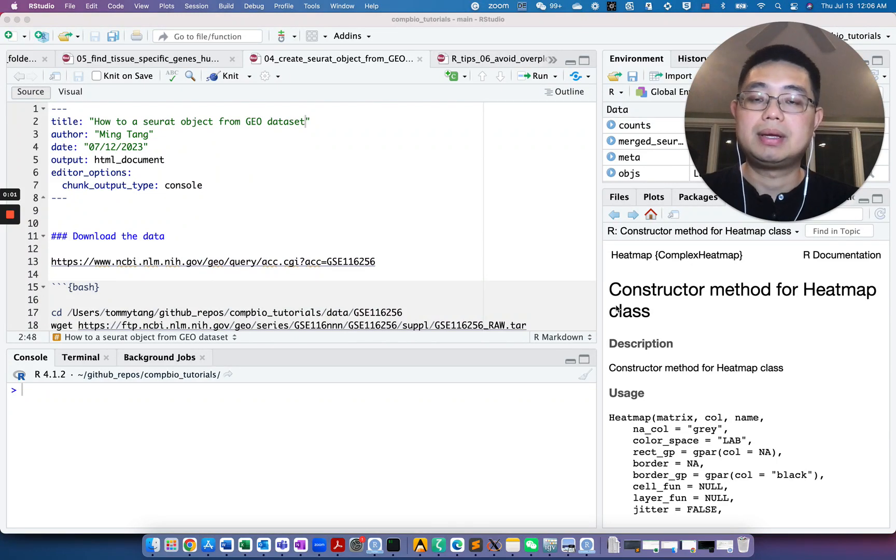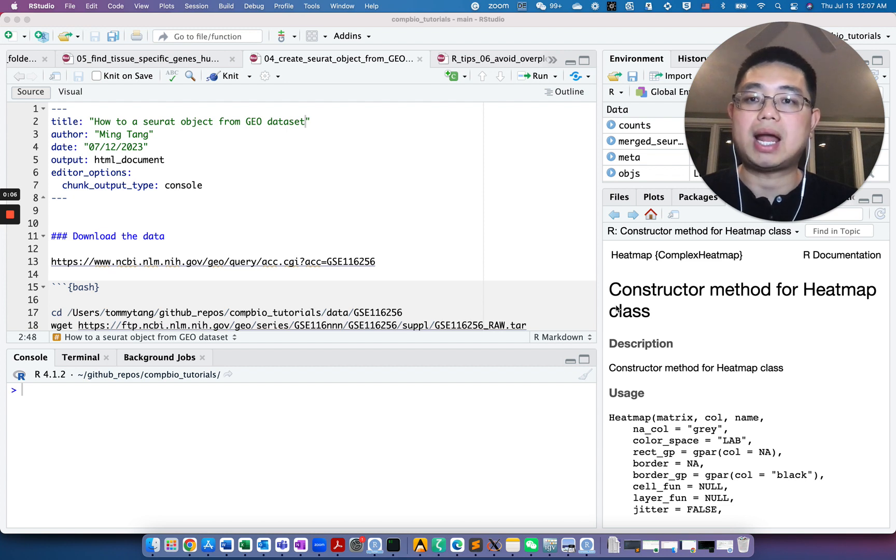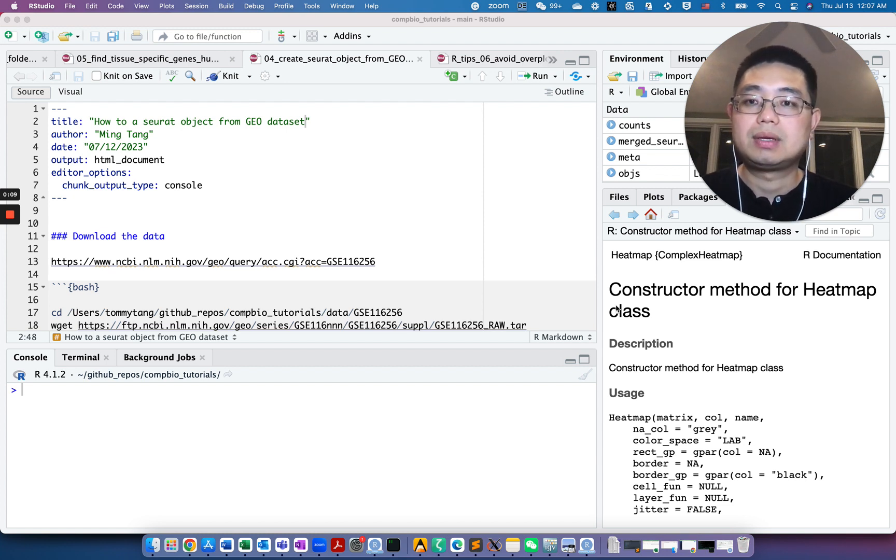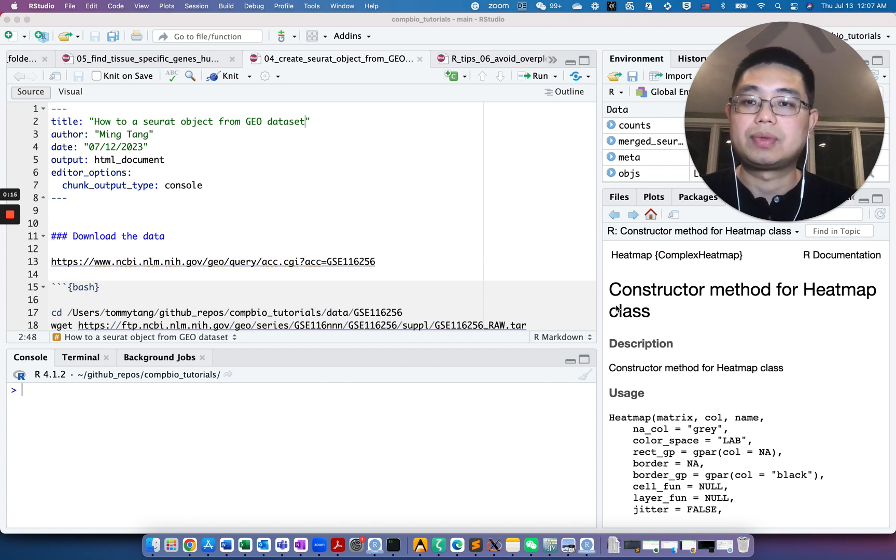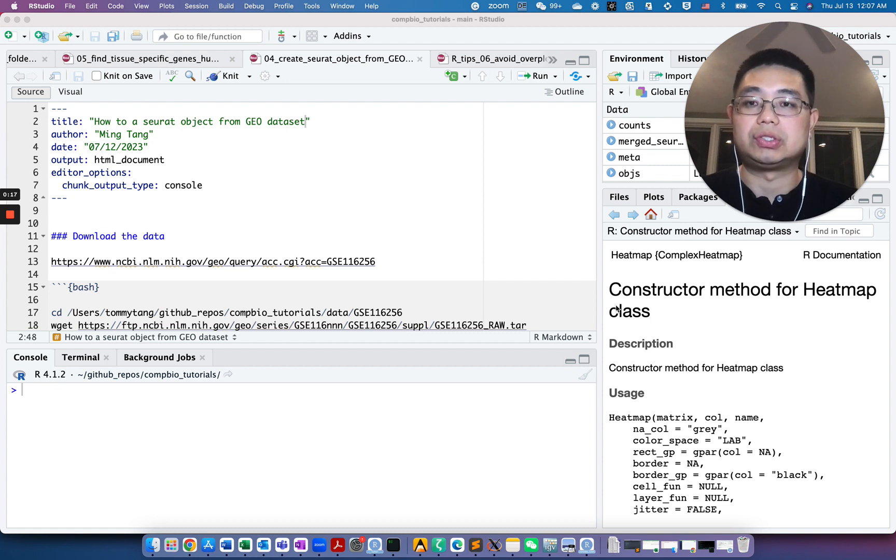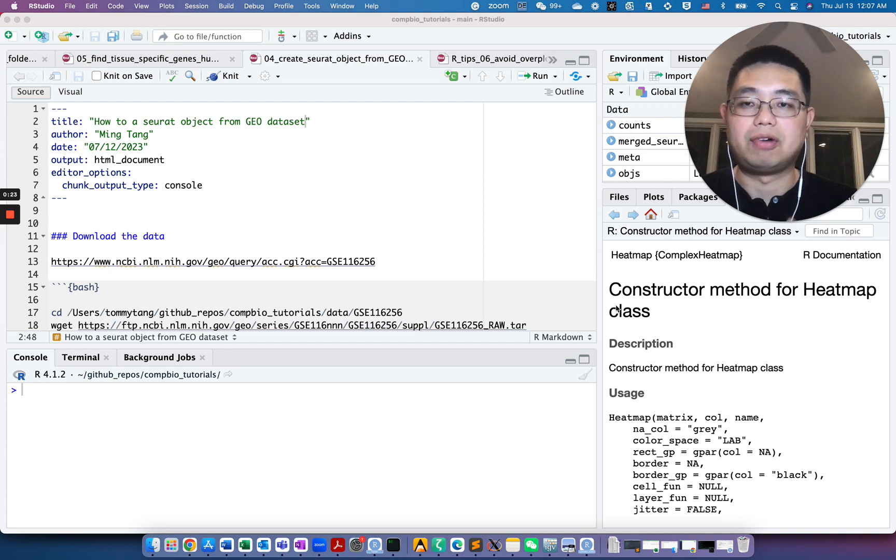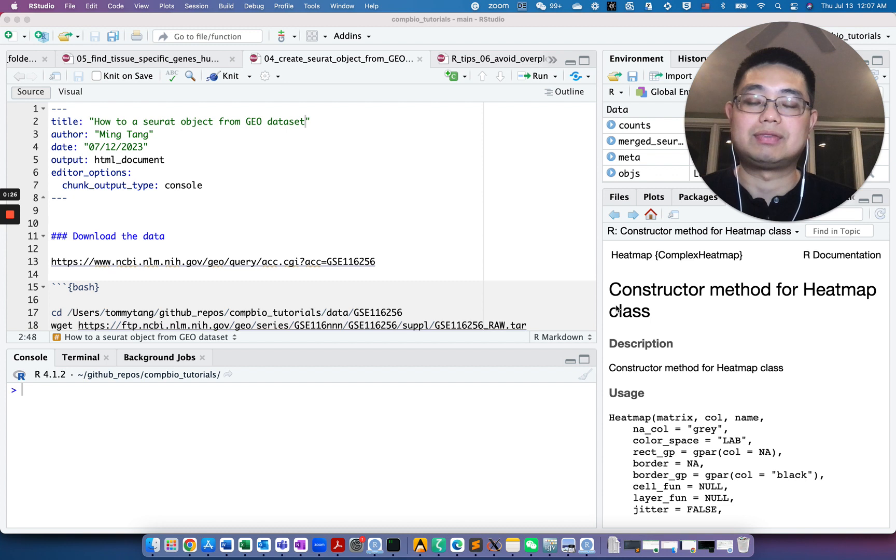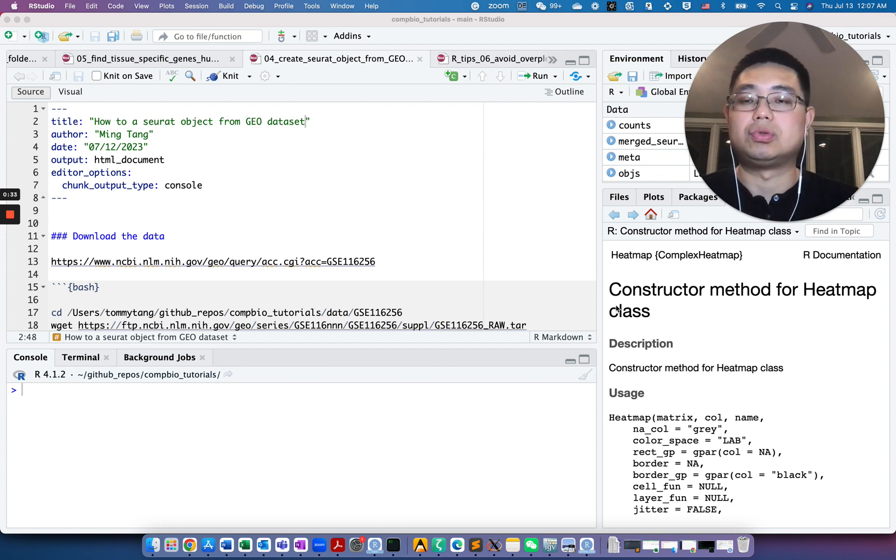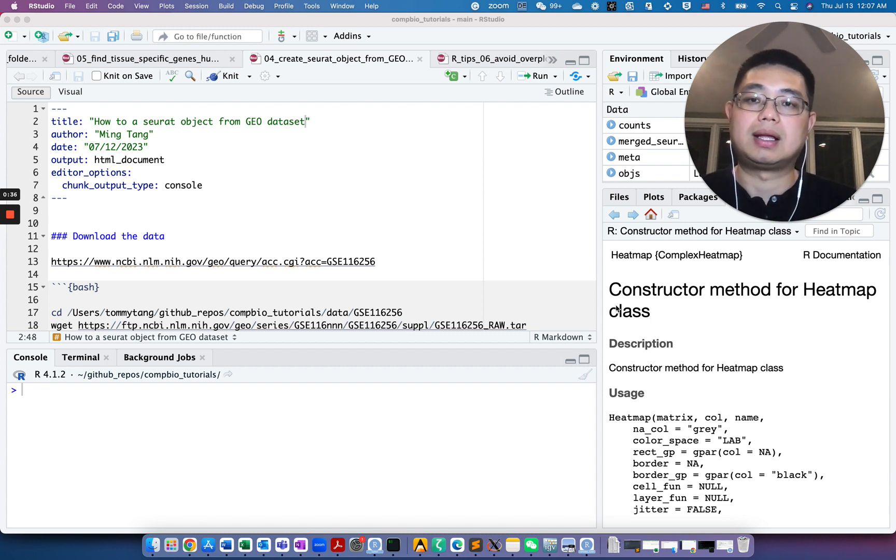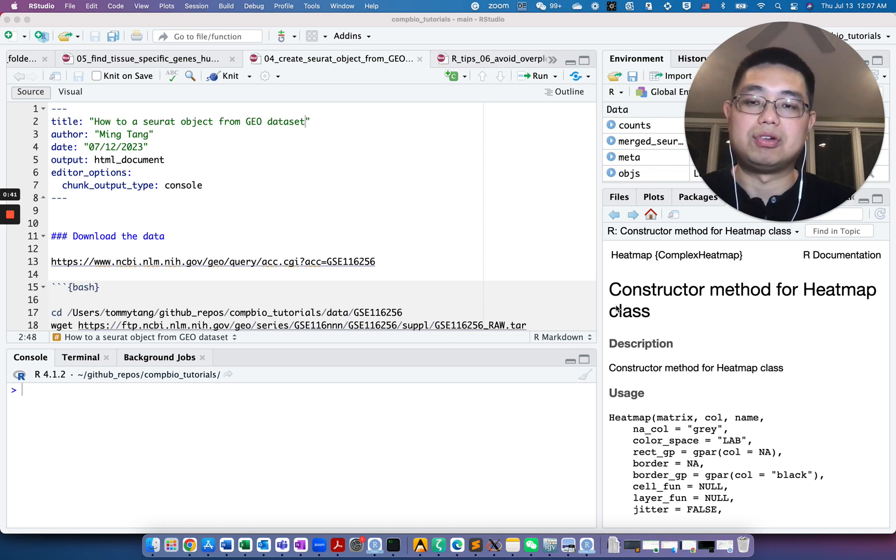Hello, this is Tommy. Welcome to Chatomics. Today I'm going to show you how to create a Seurat object from a GEO dataset. There are many publicly available single cell RNA sequencing datasets in GEO and it's a goldmine for researchers. But for beginners, many of you may be stuck at the very first step on how to read those datasets from GEO into R and convert it as a Seurat object.